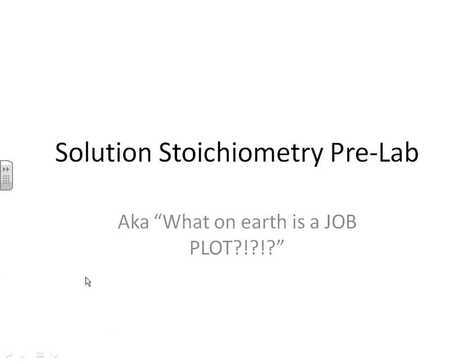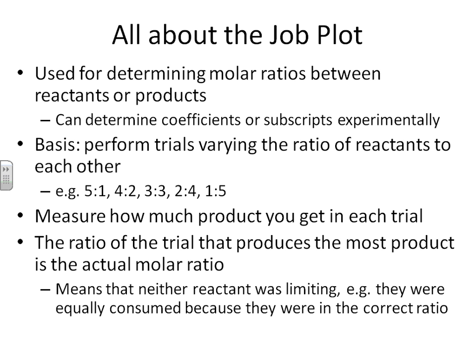Ladies and gentlemen, this is the Prelab video for your solution stoichiometry lab. This is where I'm going to talk about the concept of the job plot, but also how we're going to use the job plot in this particular lab to answer the fundamental questions. So first up, all about the job plot.